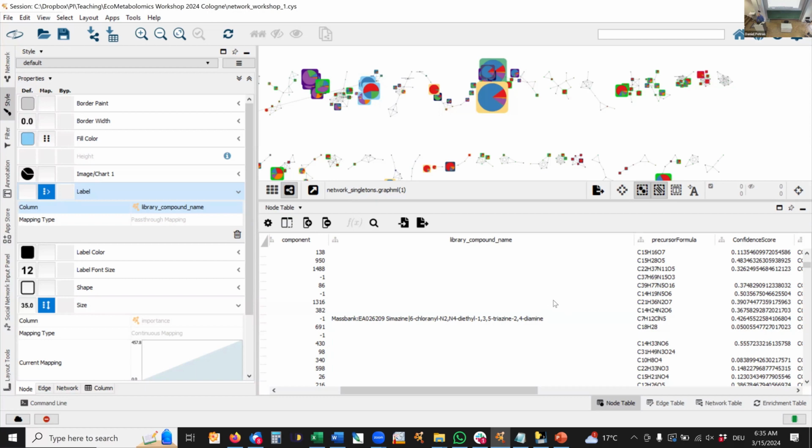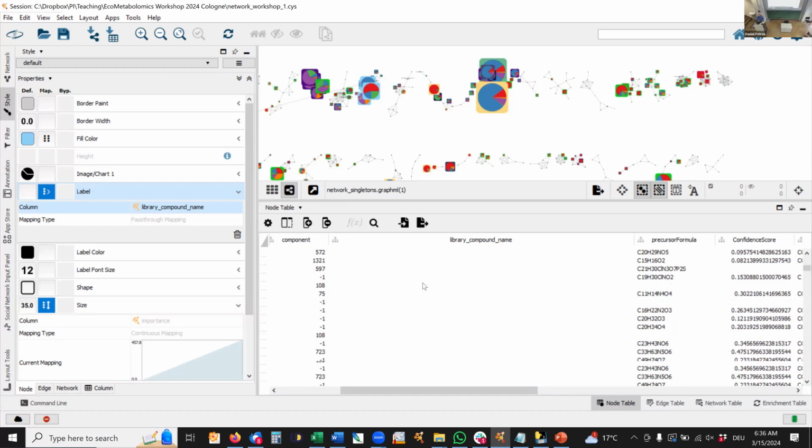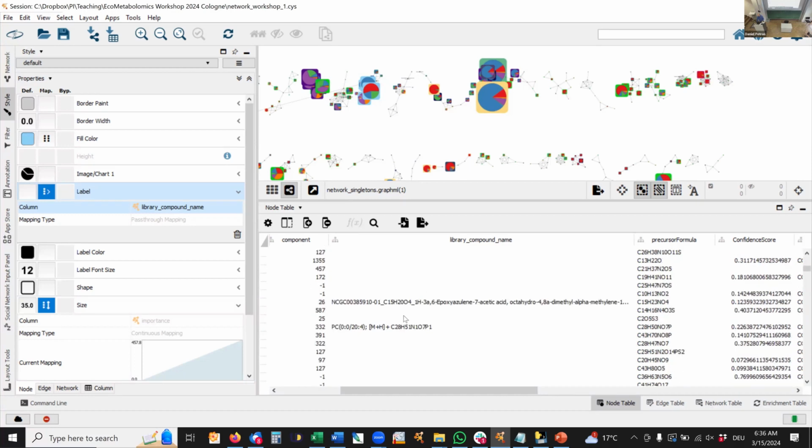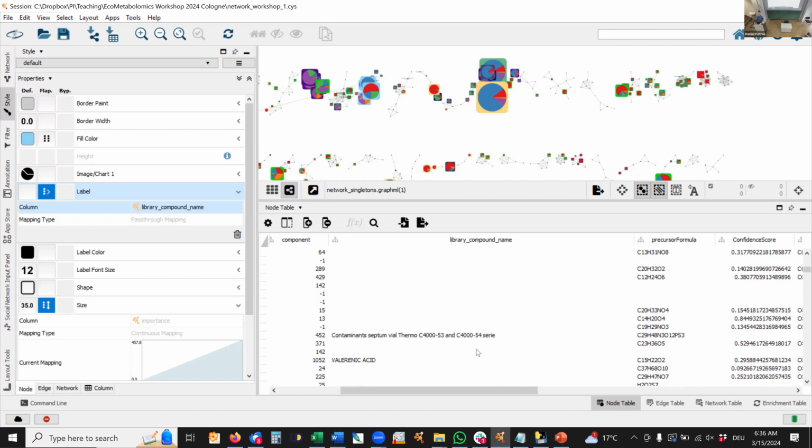Maybe not the best example, but then I can just scroll down the line and look at other things. So here we have a phosphocholine and then more phaeophytin, more phosphocholine, and then some other features. Obviously, I could also now just further filter that, right? If I would open this in Excel, I could put different categories and then only look at the mean decreased accuracies for my highest confident annotated compounds. And that's typically one way how we would deal with it.